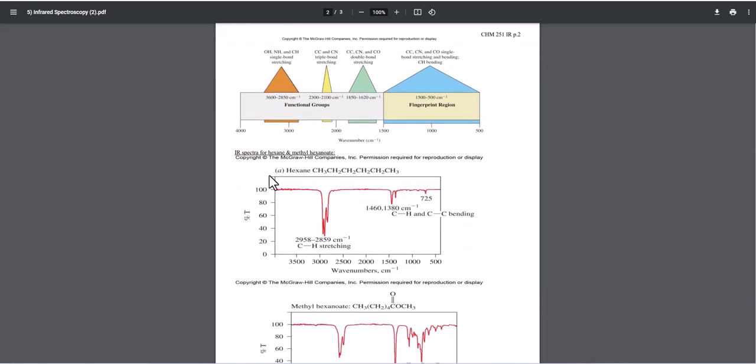So what does an IR spectra look like? An IR spectra looks something like this. We have over here %T, this is transmission. So what we're actually reading is the spectrum going down. You could think of it as being upside down, so it's % transmission. At a place where it's high up and flat, there's 100% transmission, so there's no vibration going on in this region. And when we have a peak, which is upside down, then we do have vibration in that region.